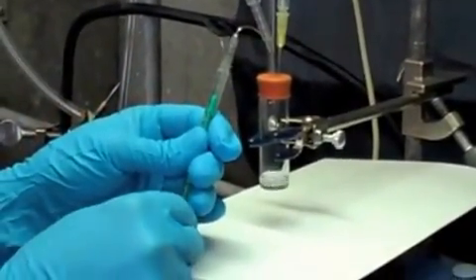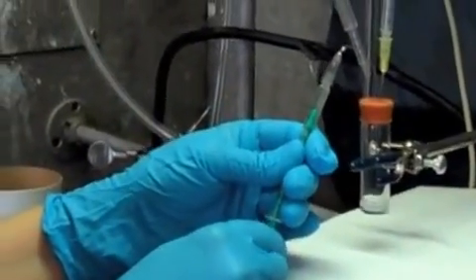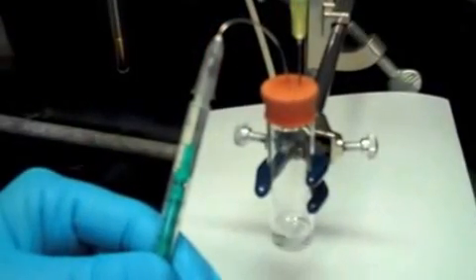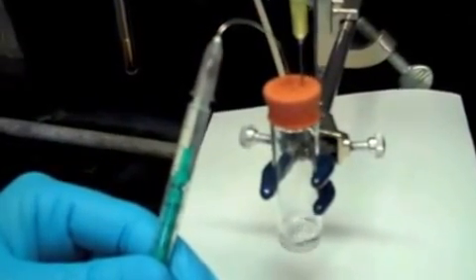In order to get an accurate measurement, I will do this process until a drop of the solution hangs from the needle. See the little drop? It's time to read my syringe. I'm starting with 0.35 mL of solution, 350 microliters.